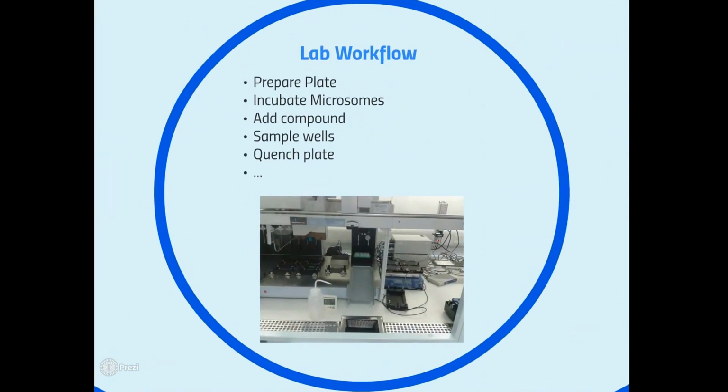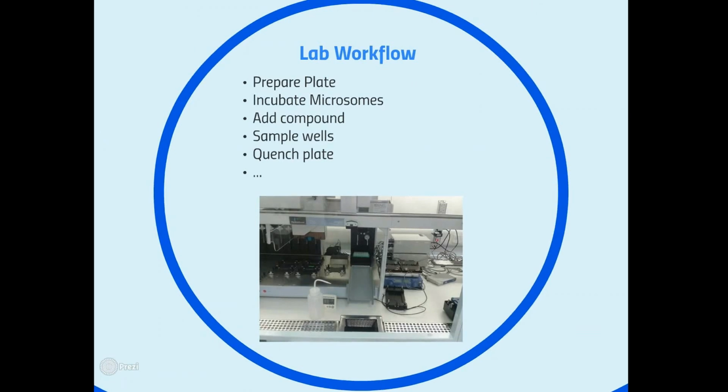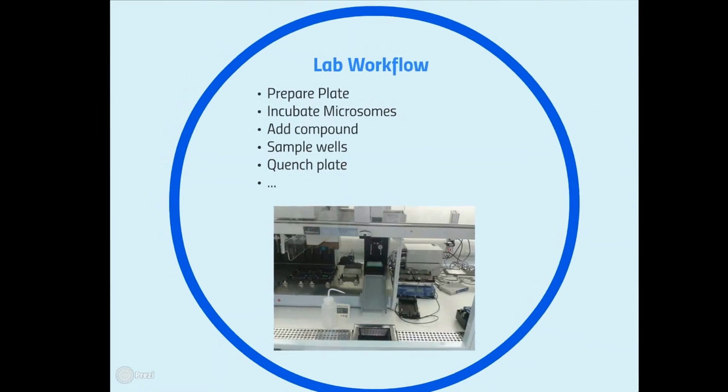Not only do we manage that macro level workflow, we're also looking at the micro level workflow within the lab itself. So here would be perhaps a typical workflow. We're going to prepare the plates, we're going to incubate the microsomes, add the compound, then sample the wells, quench those plates, and then obviously run them through the mass spec, and then bring everything together to do the analysis.